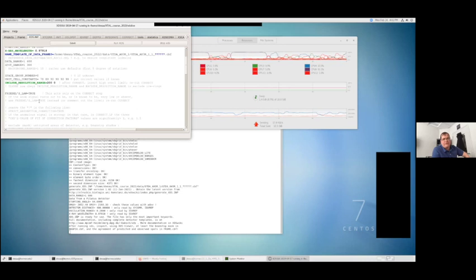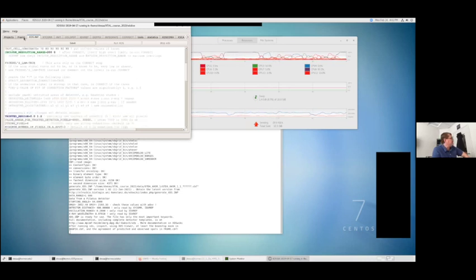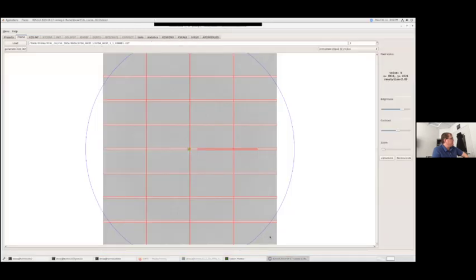Okay. Occasionally, I underestimate how far my crystal diffracts, and so I can see on my diffraction frame that I might have diffraction out in this area that's visible to the naked eye. And if I can see it with the naked eye, then the computer definitely can see it. And so in that case, I might bump that trusted region out.